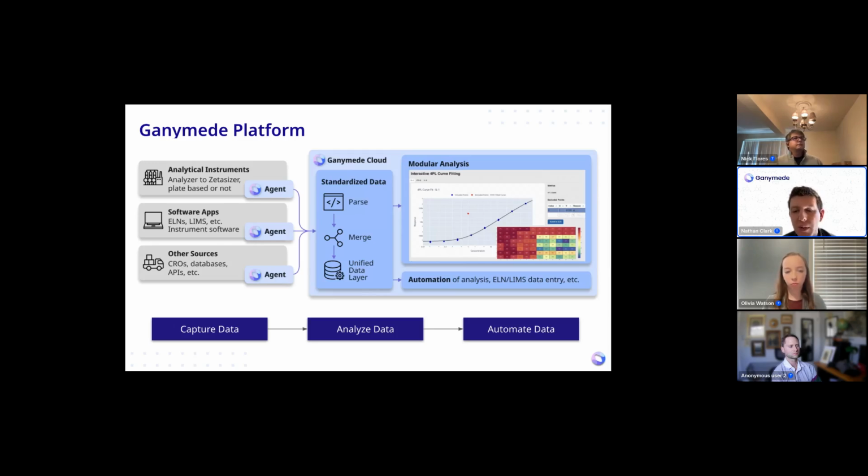This is, I would say, something that we want to be a very tightly coupled thing to the workflow for high scale workflows or workflows where you do know what the assay is enough to start standardizing it and automating it. We don't necessarily want this to try to supplant dedicated tools like a GraphPad or like a FlowJo for flow cytometry. Those tools are great and have been built out extensively over the years to handle a lot of edge cases and be great for exploring data. But once you are starting to get tired of doing analyses repetitively, or you have some particular analysis use case that's more unique, that's where we can come in.